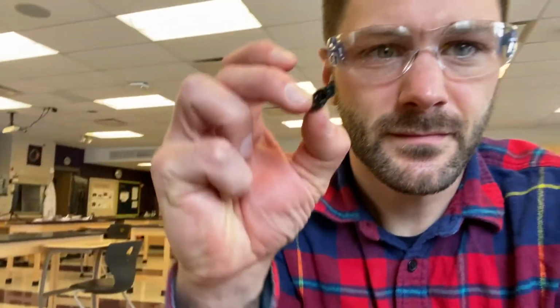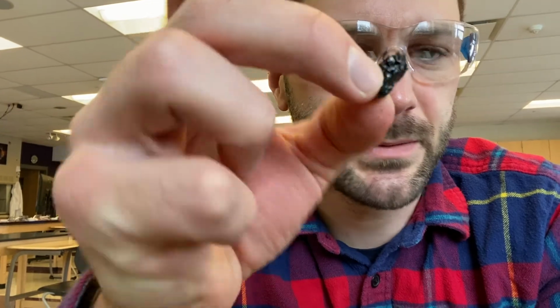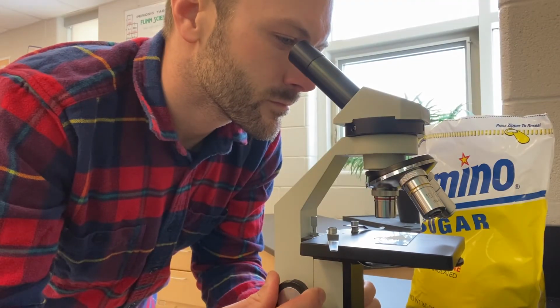So hopefully that gives you enough observations as to what perhaps this stuff might look like based upon the observations you took on camera, okay? So that's a pretty solid chunk there. It's a pretty solid piece. Oh, I know what I forgot to do. I forgot to put it on a microscope. So what I'm going to try to do, just so you have some pictures of the sugar on a microscope, is put it on a slide so you can see what this looks like when it's magnified much larger than its own size. Maybe we pick up on some things that we didn't with our observations. So keep your observations ready to go as we look at them underneath a microscope. Oh, wow.